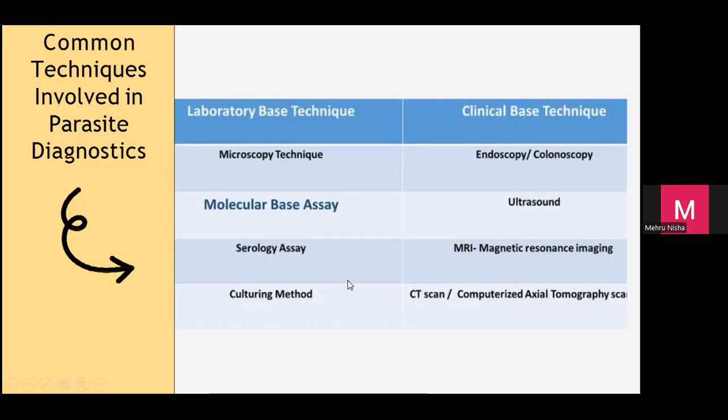Okay, let's look at more detail on laboratory, which is more related to us. Is everyone already familiar with microscopy? Are you all good in microscopy? Okay, tell me something about the microscope. How many lenses are there? How many objectives does a microscope have? What is the lowest? 4 times? Yes, okay, 4 times.